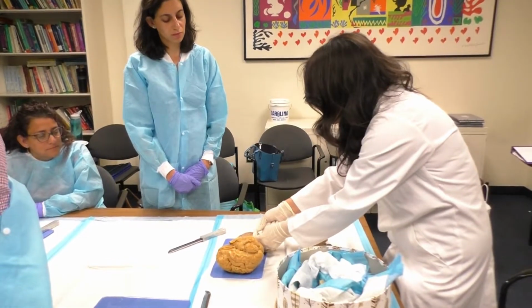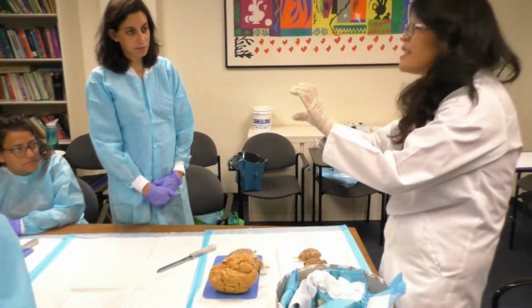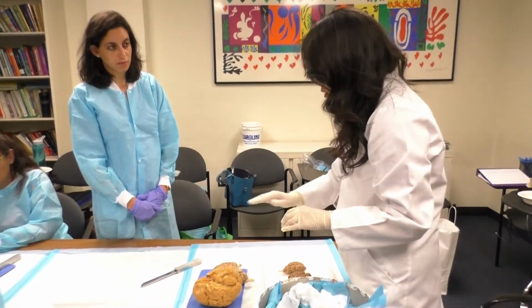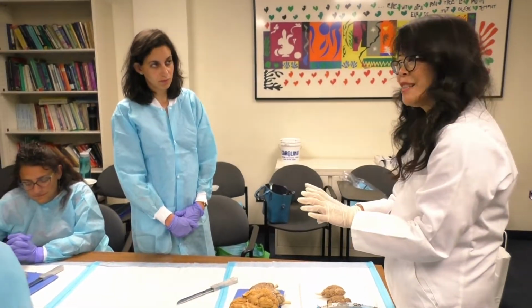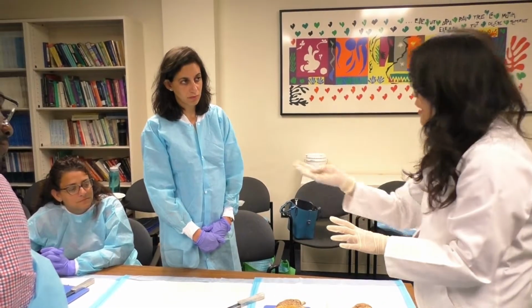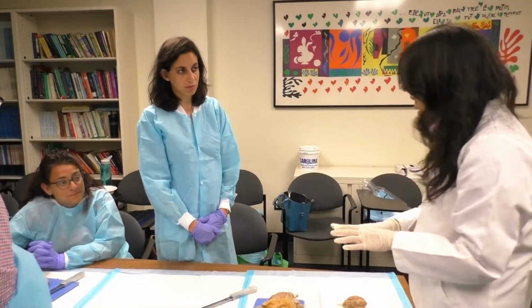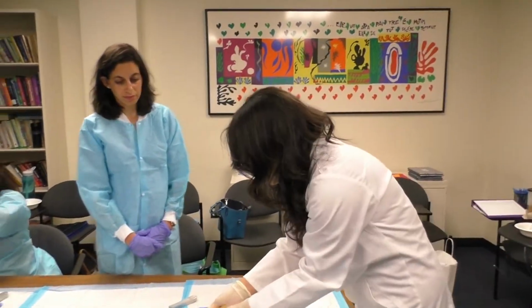And so the top part is way up here, and the bottom part is down here. So we're going to see this C-shaped structure once we go into it. Even though it's a different configuration, it has very similar functions. So as you mentioned, memory, spatial orientation, absolutely, that's exactly what it's doing in both the sheep brain and the human brain. Okay, so those are the lobes.